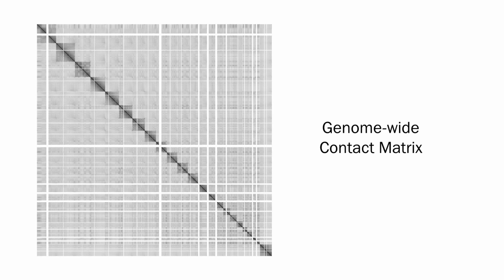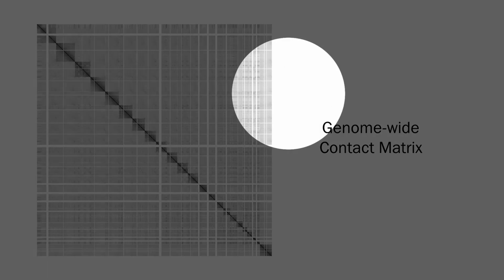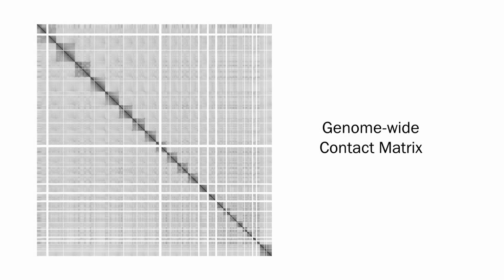Chromosomes, yes. So these are the chromosomes. This is a human genome. There are the chromosomes, chromosome 1 all the way, and then that's the X chromosome down here. You also see some interactions off the diagonal, but it's generally fairly weak overall. You also see this dark line along the diagonal, and these local interactions are the strongest ones and the ones that are observed most frequently. This is simply because the sequence is obviously connected.